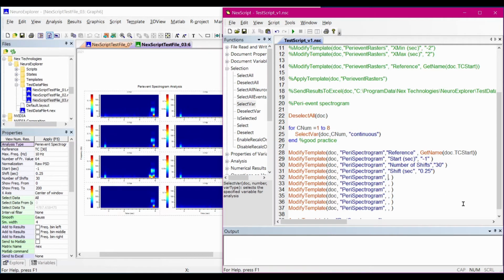Another parameter I want to set is the number of frequency values. I think of this as the y-axis resolution. So if I only have, say, 50 as my number of frequency values, or right now it's set to 64, for each time shift window, I only have 64 frequency values. And because I have my show frequency from to show frequency to values set from 0 to 200, I only have 64 frequency points spanning that entire range of frequency values.